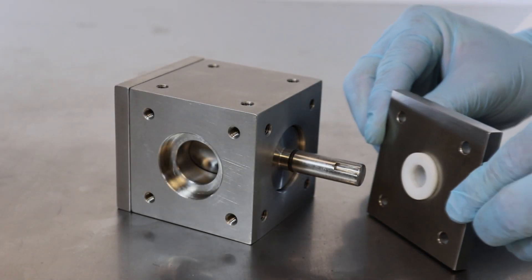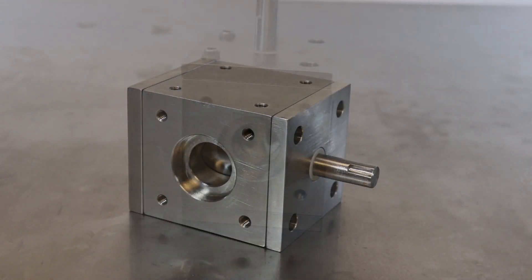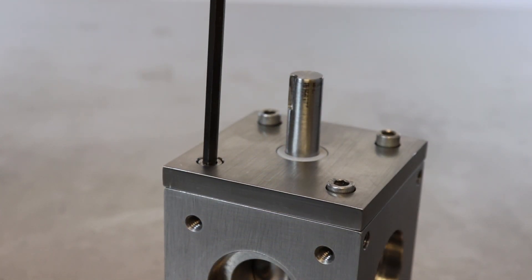The opposite faceplate has a bushing with a through hole to fit over the long rod of the rotary piston. Insert four 1/2-inch, 1/4-20 stainless steel bolts and use a 3/16-inch Allen wrench to tighten them snug.